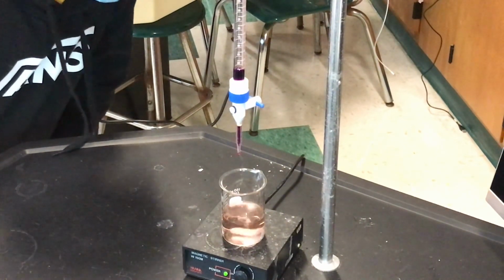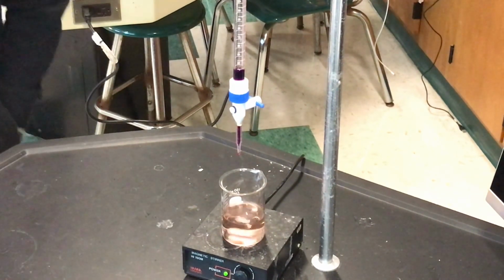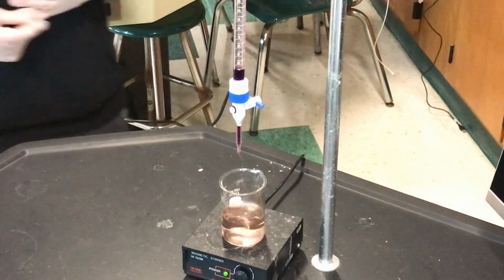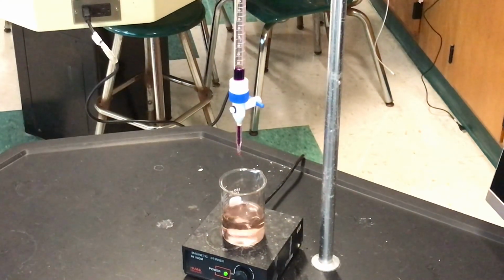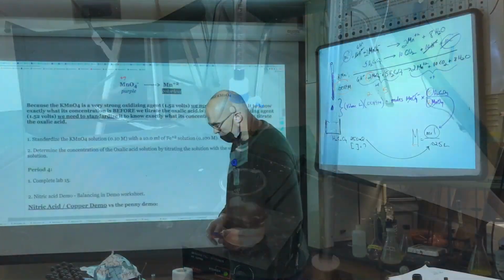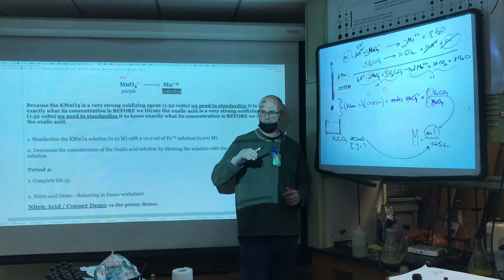I mean, it's like below 50. So just do an estimate of what you have there. I mean, I did a couple extra drops by accident. Okay, so about 50, so you want to say you did extra drops after 50? All right, so 50.00. Looks like it may have been just a little bit past the end point. What was the total volume of potassium permanganate when you subtracted the two initial and finals?